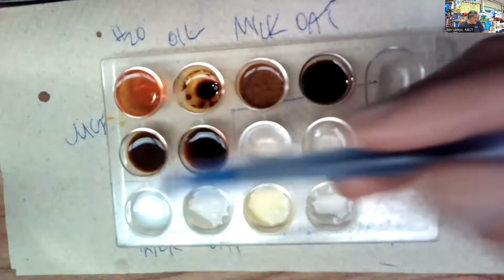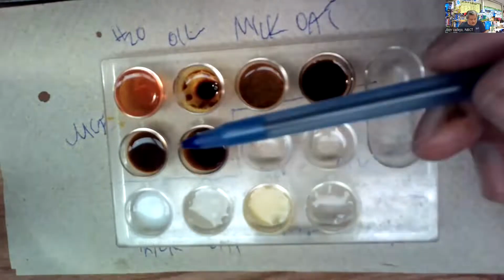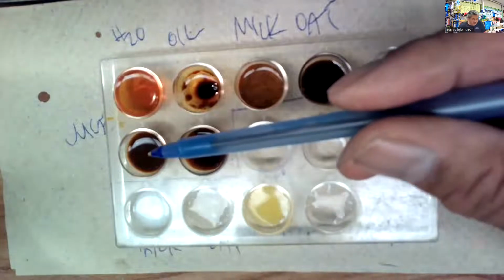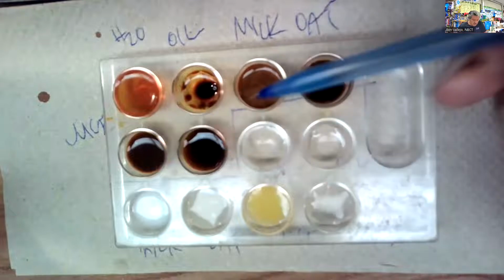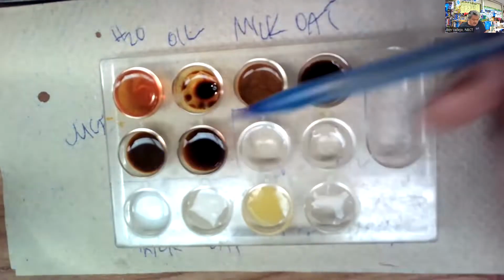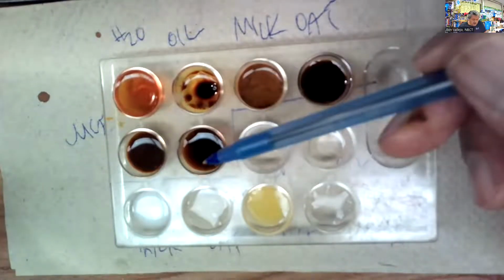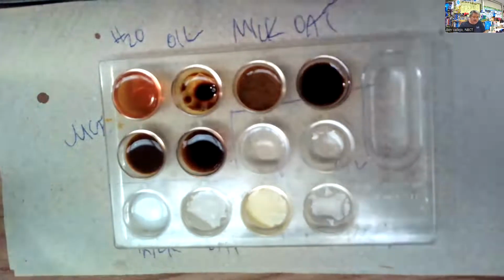And the juice, is juice starchy? Well, juice has sugar in it for sure. But as far as starch, the juice has simple sugars, the monosaccharides in it, but not any starch. That looks like about the same as milk. You don't usually think of milk as a starchy substance. These two are about the same color. But the unknown X is a little bit darker than these, so I'm going to call that a positive. And that oatmeal, I'm going to call that a positive as well.